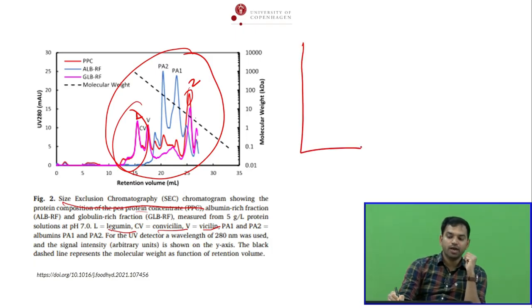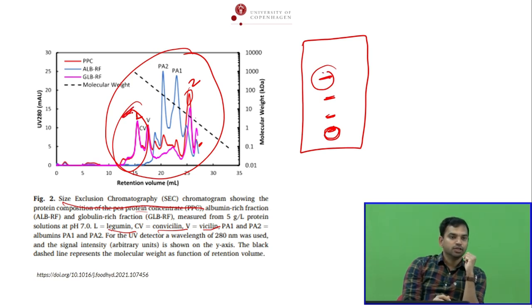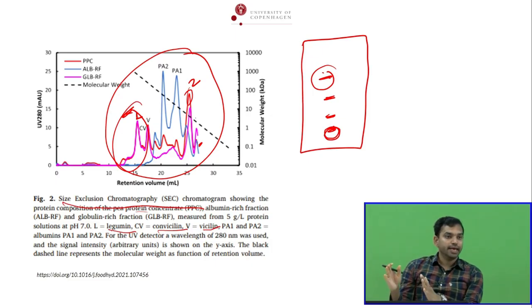And this is actually very complementary to your SDS-PAGE. Remember my previous class, SDS-PAGE? In SDS-PAGE, you get the last band here, and that will come here. Okay, the big one will come here. So we often use size exclusion chromatography complementary to SDS-PAGE.